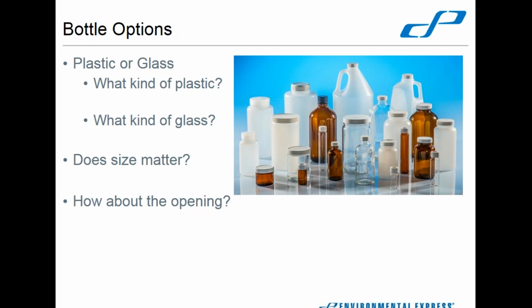That's a common requirement on a lot of the sample bottles. Some sample bottles, such as your bacteria, need to be any type of plastic that can be sterilized in an appropriate manner. So usually that's polypropylene, polystyrene, something along those lines. And those are really the types of plastics that typically get covered in this.